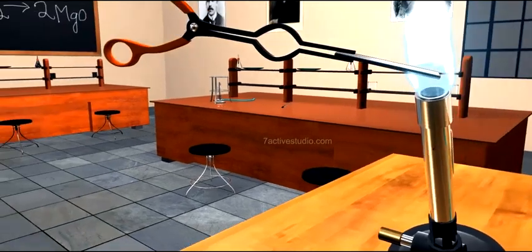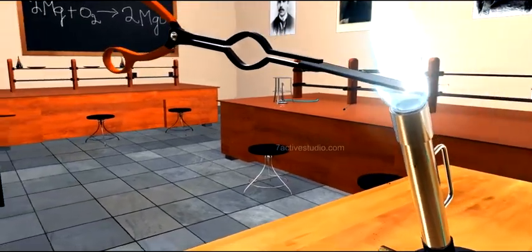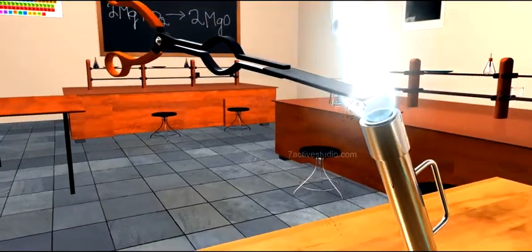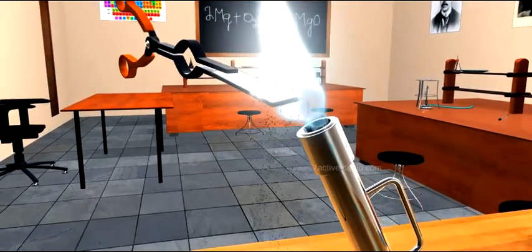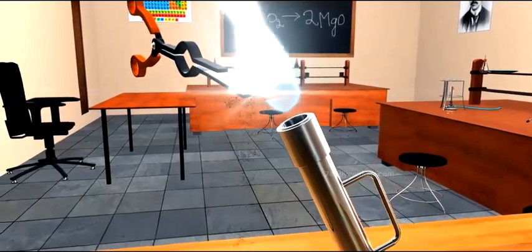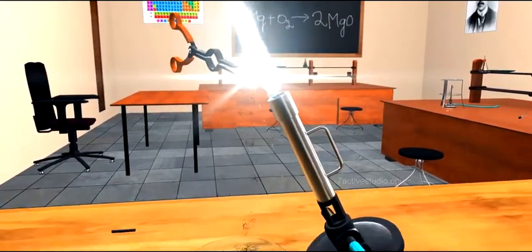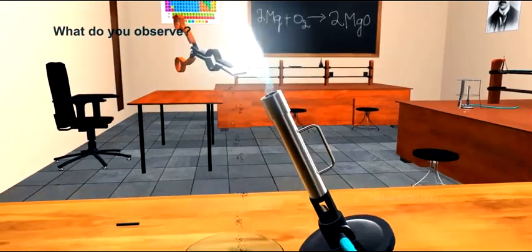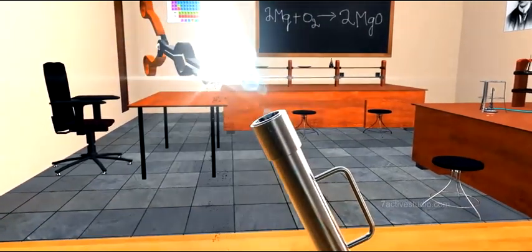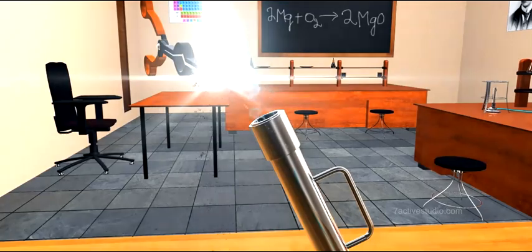Position the watch glass and observe carefully what will happen. Collect the ash into the watch glass. What do you observe? You can observe here an intense brilliant white flame.